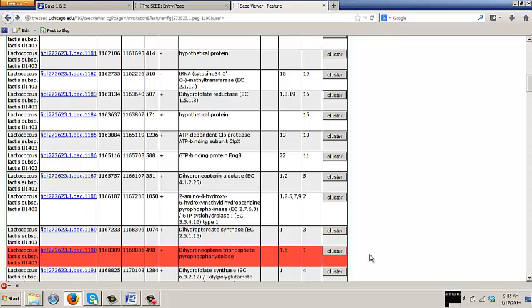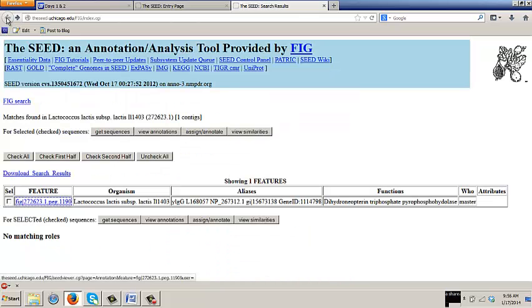So my answer was that we're not going to analyze this deeply. We're just going to see if there's anything there, we run with it, and if there isn't, we don't worry. That's the technical reason. Okay, so come back out of here, just back out to here, and instead of clicking on tabular region, click on sequences. So you just have to go back one and then click on sequences.